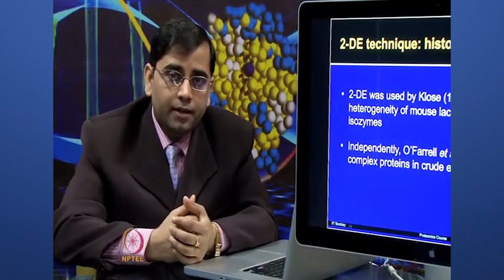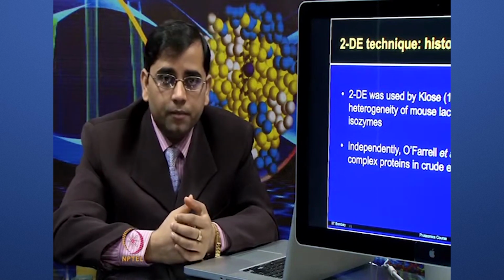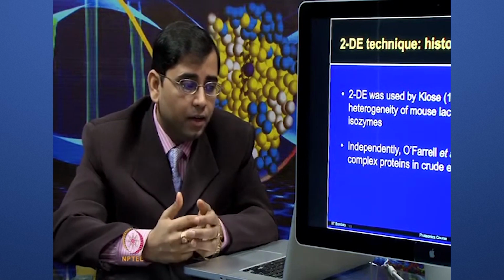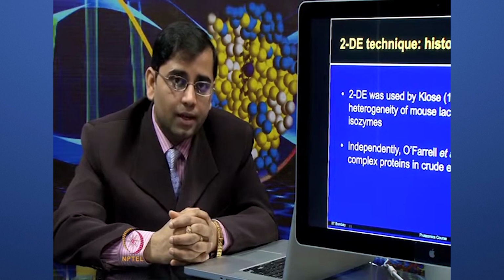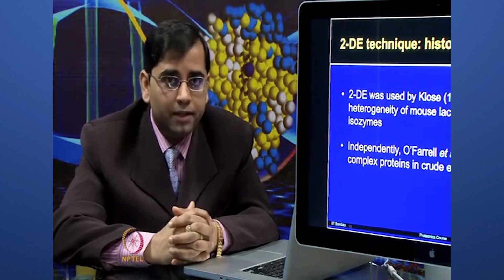So as I mentioned earlier, two scientists, Klose and O'Farrell, independently investigated different problems by applying two-dimensional electrophoresis, and in 1975 they reported this method independently.